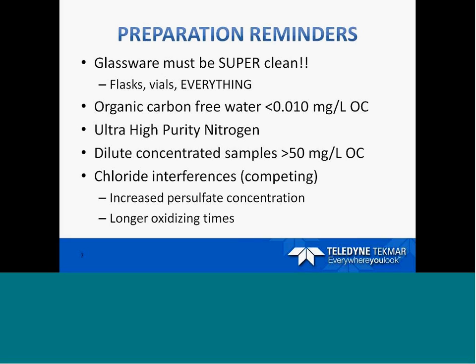Chloride interferences. If I had a nickel for every time I got the question, can I run salt in my samples? This is a varying question depending on whether you're running UV persulfate or combustion. As we know, with combustion you're using heat and basically oxidizing that entire sample, so you have a bit more flexibility with the amount of salt that you have in your samples.